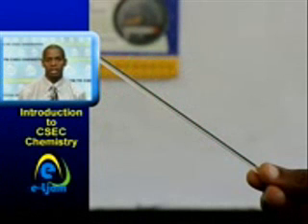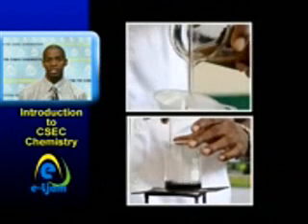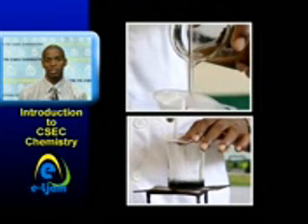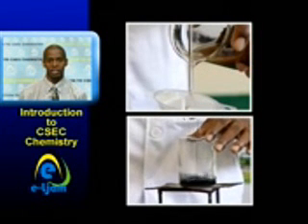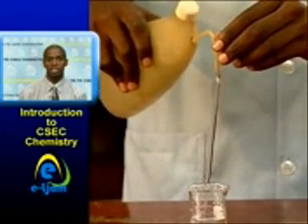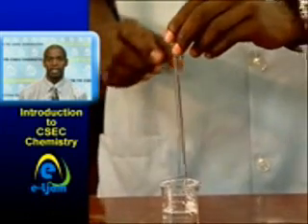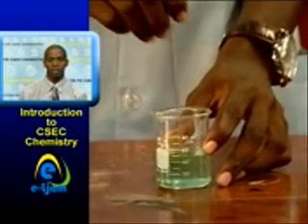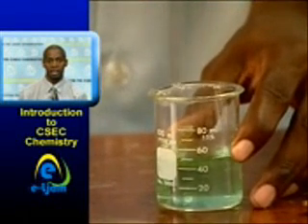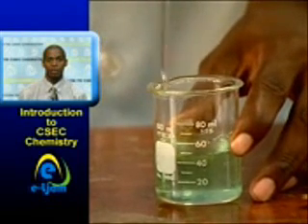This is a glass rod, typically about 6 to 12 inches long, 1/8 to 1/4 inch in diameter, used to stir substances or to transfer liquid substances from one container to another without spillage. Before using the stirring rod, ensure that it is clean to prevent contamination of the substance. Be careful not to put excess pressure on the rod, as it can easily break.